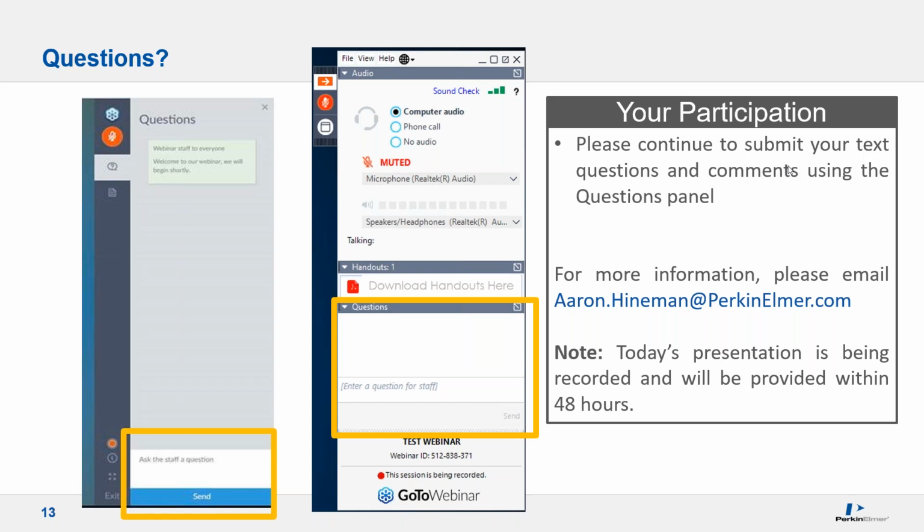Next question. Can MSF be used if you have multiple analytes of interest and multiple interfering elements, some of which are also analytes of interest? Yeah, sure. So that's the part of MSF that can sometimes be a little confusing. Whatever wavelength you are sitting in when you're in the examine window is your analyte, and the others are interferences. So it's just a matter of identifying them correctly within the examine window.